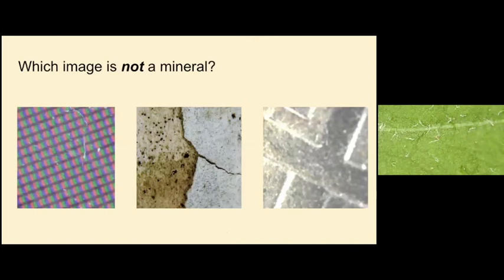The first thing I observed about the first image is that it's very colorful, and I can't really think of an animal or a plant that would have that many different colors in it. So that's why I would say mineral for the first one, but it's really hard to say what it would be. The second one is kind of hard to tell too. It looks kind of brownish, which makes me think of some sort of wood.